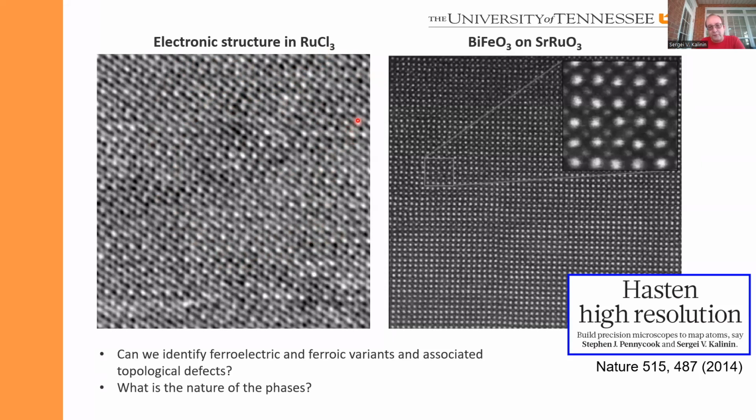Here, for example, you can clearly see these dimers, and here you can see there are no dimers. So it looks like there is a mixture of two phases, but you really need to go pretty far off the limb in order to say that you clearly can see the difference by eye. This is another example.